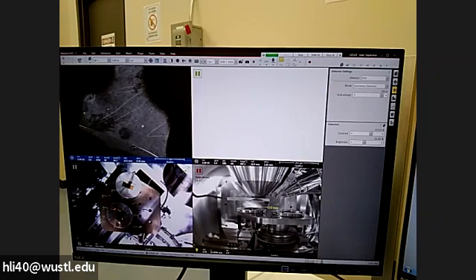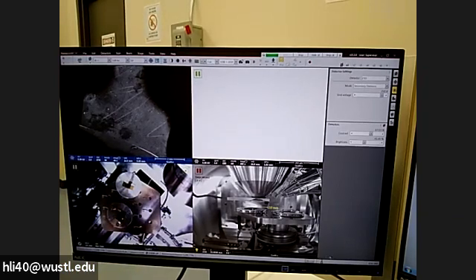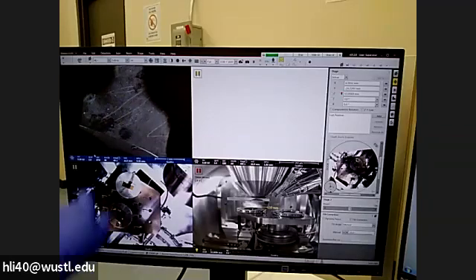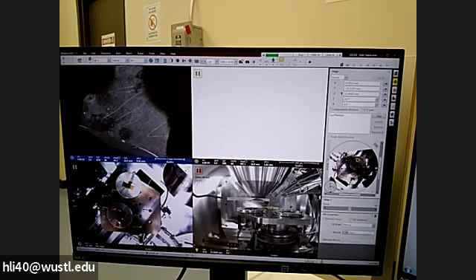Okay. The image here, if you don't use image rotation, when you have image rotation or rotate, you will see an icon here. Or if you don't have stage rotation, the stage rotation is 0. So the image, what you see here is 180 degrees rotated. For example, now, if you look at this interface, this side is silicon wafer, this side is a whole metal stuff. But if you look at it, it's reverse. So just put that in mind when you drive.